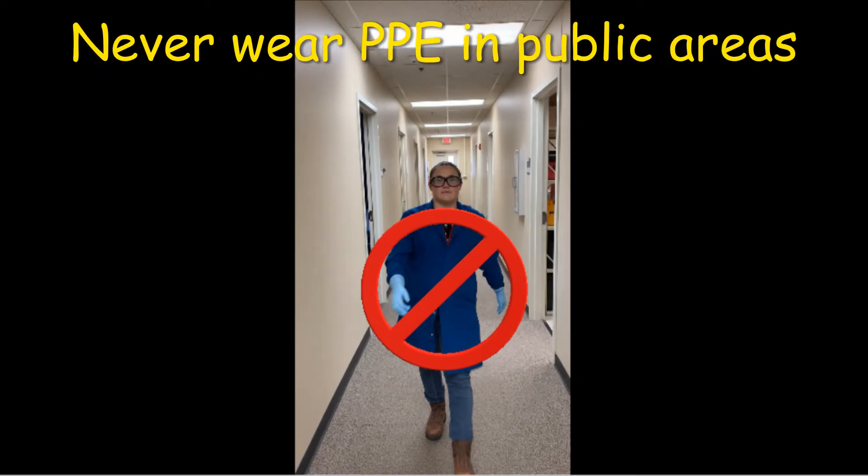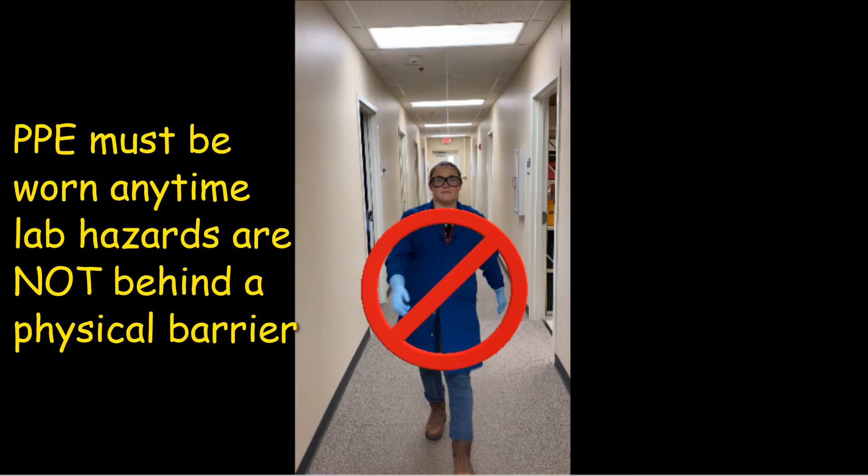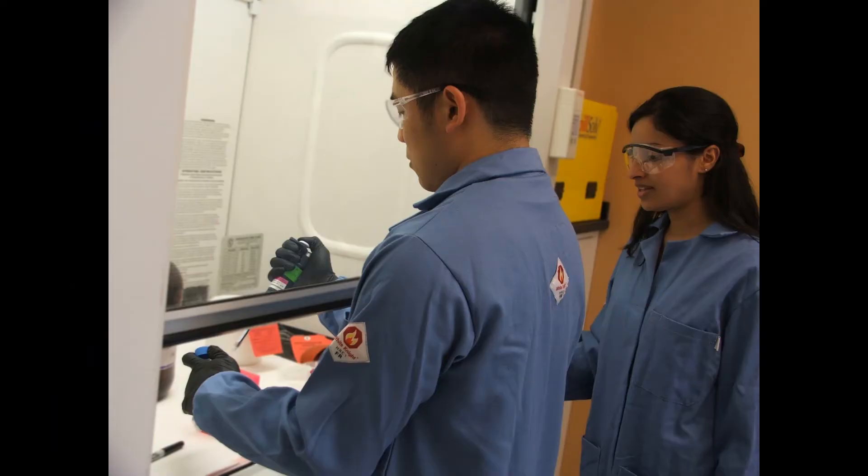Never wear PPE in public areas, including elevators, hallways, classrooms, or office spaces. You must wear PPE in your lab space anytime that there are laboratory hazards not secured behind a physical barrier. This includes when lab mates are working and you aren't. Sitting at a computer in a lab space still requires a lab coat and eye protection.